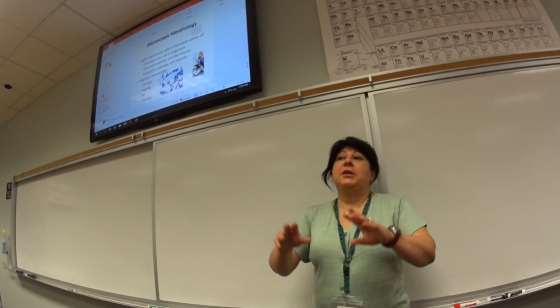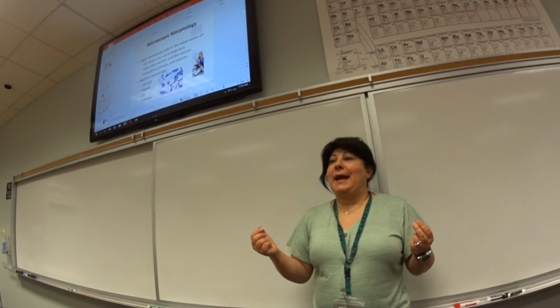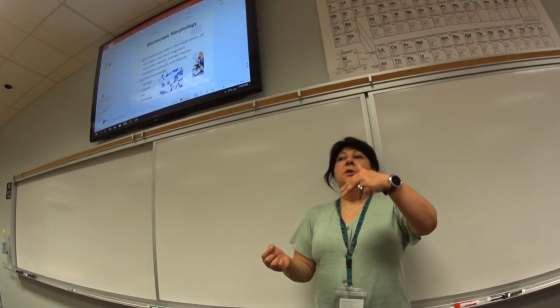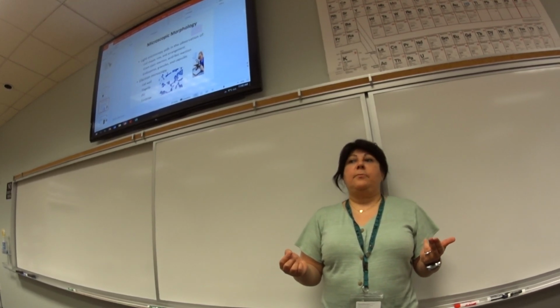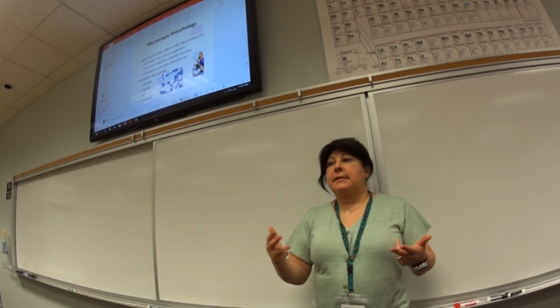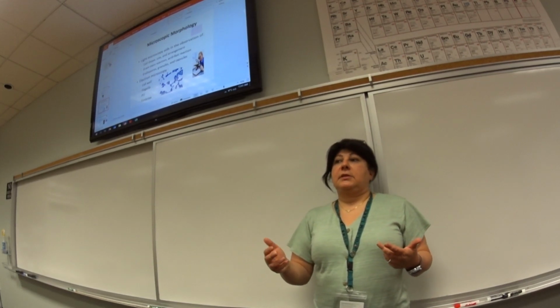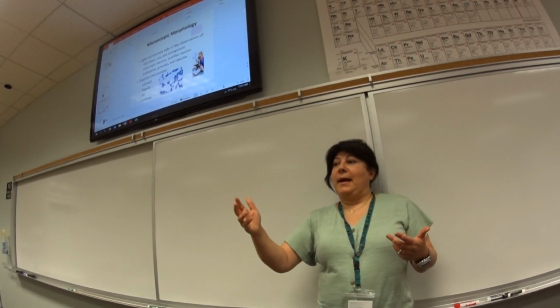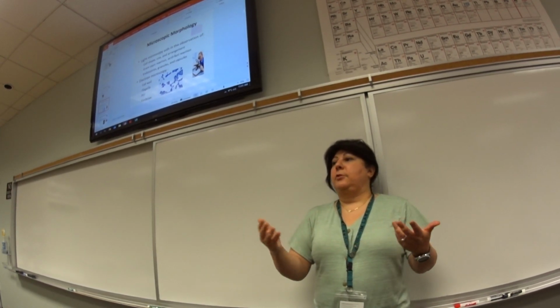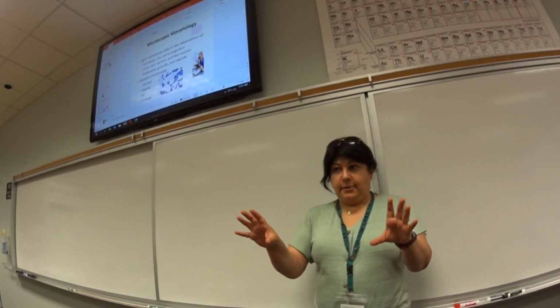Then in your conclusion, if everything went well, on that day you can actually figure out what you have. So based on the results from day 1, my possibilities were Staphylococcus aureus, Staphylococcus epidermidis. Because of the results of like gelatinase and mannitol and this, it indicated that my bacteria is Staphylococcus aureus because of blah, blah, blah, blah, blah. Great. You're done with that.